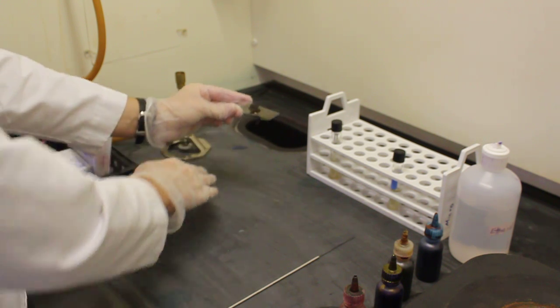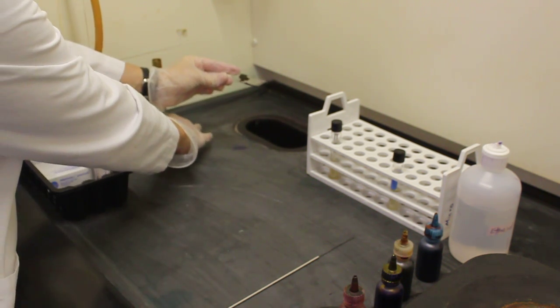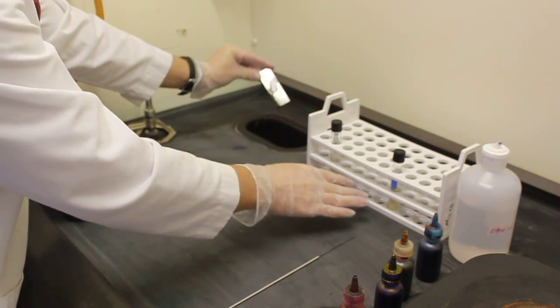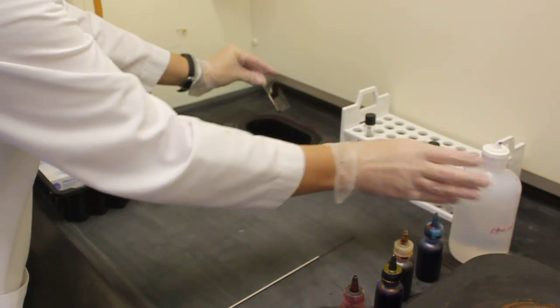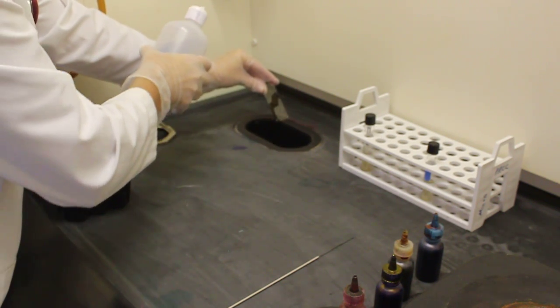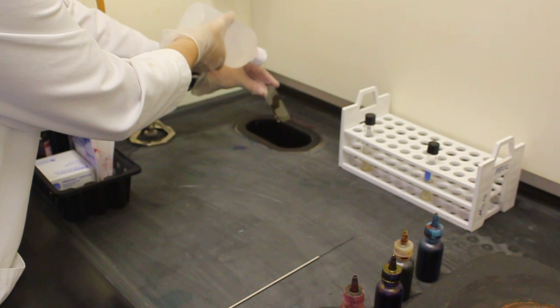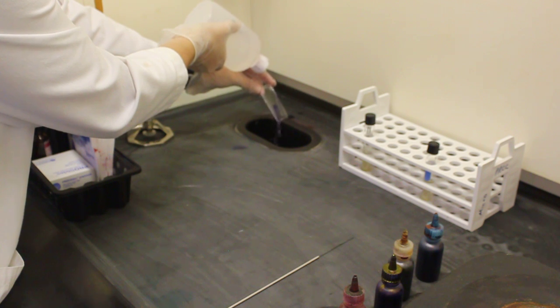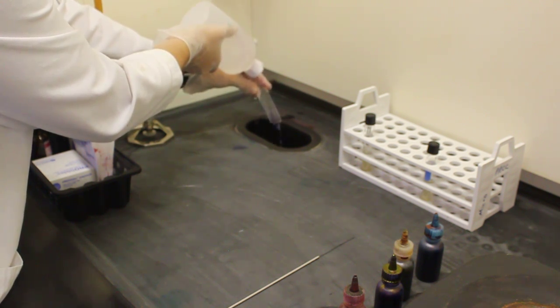Assuming that one minute has passed I am now ready to apply my step three decolorizer. Holding the slide over the sink at an angle I will drip the ethanol onto the top of the slide letting it run down. I'm going to let this ethanol run down the slide until I no longer see any purple streaks.